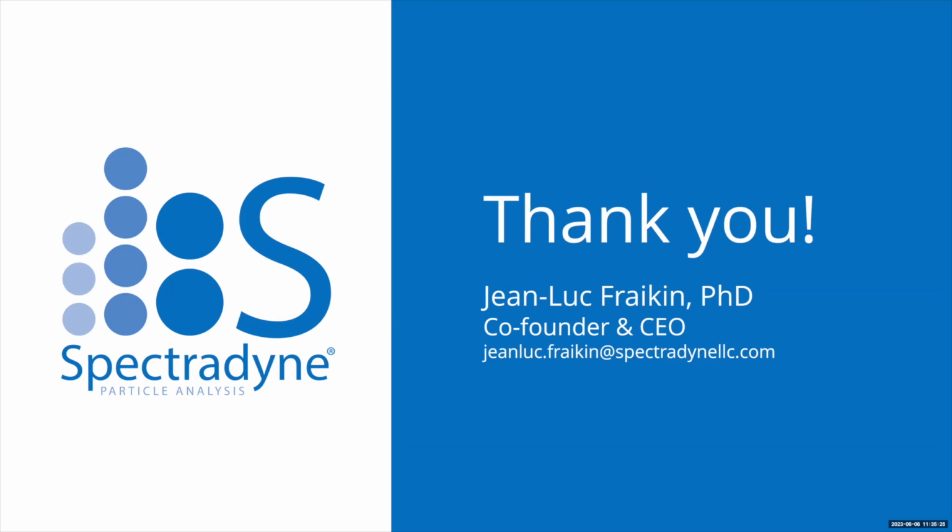Hello, thanks for this nice presentation. Just a question about the components you use for fluorescence detection. Is it avalanche photodiode? Is it photomultiplier? Is it something different? Is it single photon avalanche photodiode? We're using APDs, yeah.